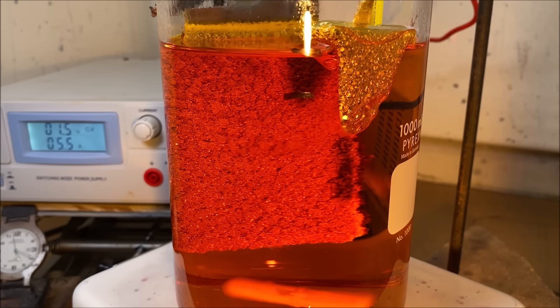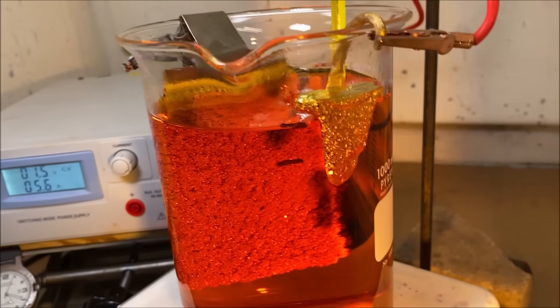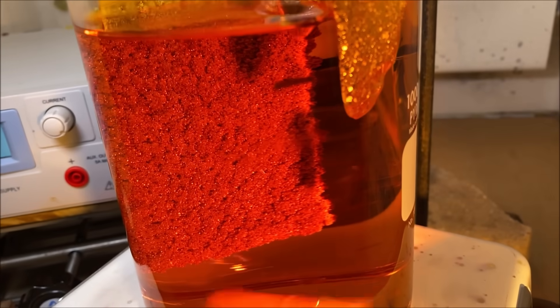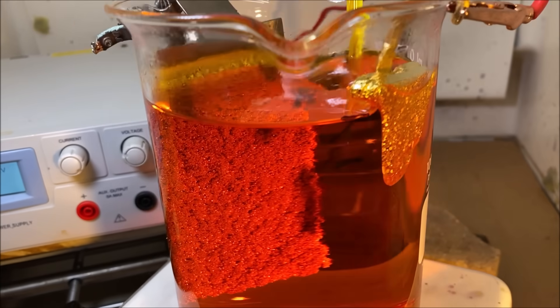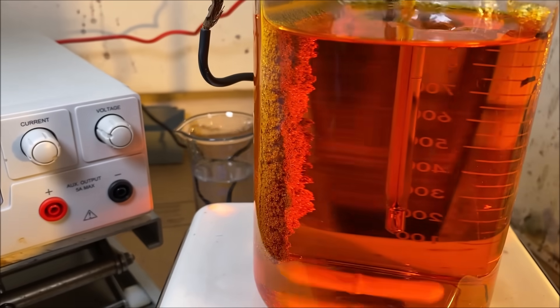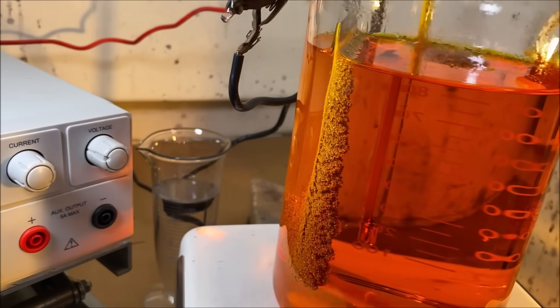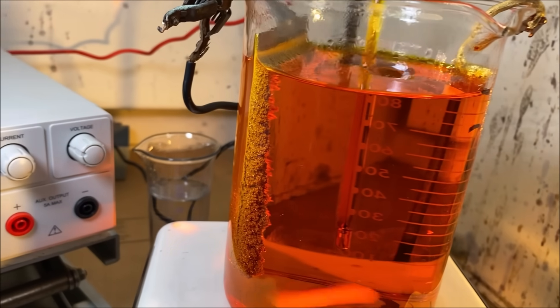The current flow is dropping off, so I think we've taken this just about as far as we can. The anode bar has corroded completely, and our cathode is just literally caked with high purity gold crystal.